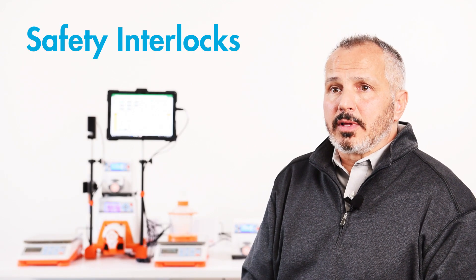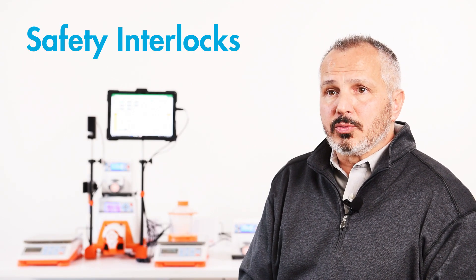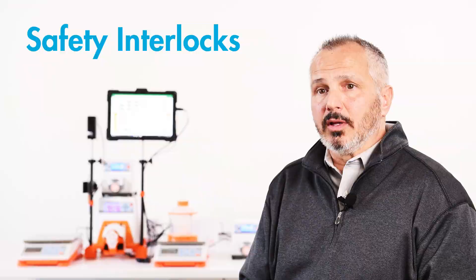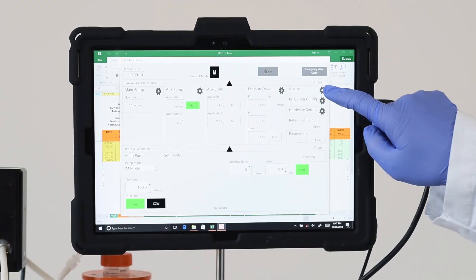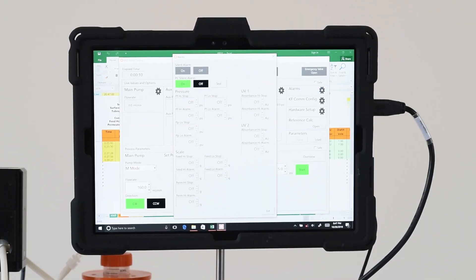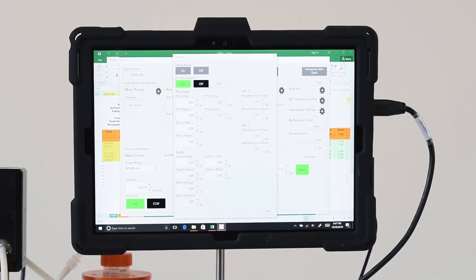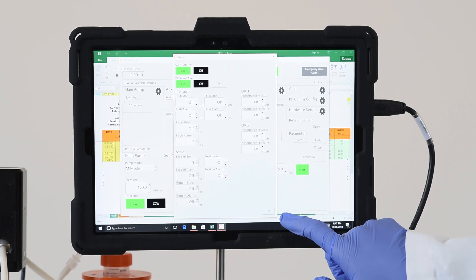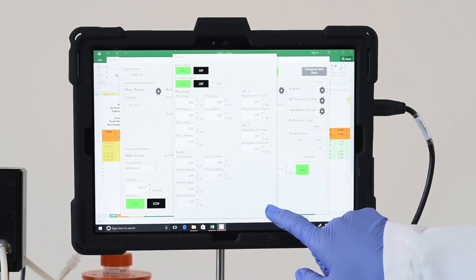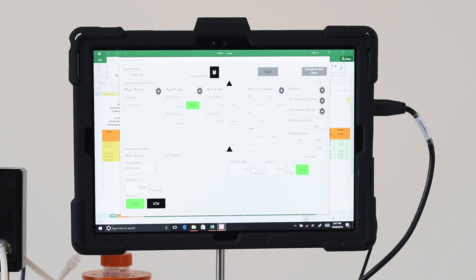All TFF systems on the marketplace require some level of safety. Our system has gone above and beyond that, with interlocks based not only on pressure, but also on weights or volumes on either the permeate scale as well as the feed scale.